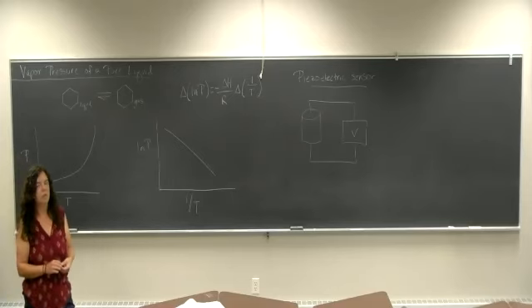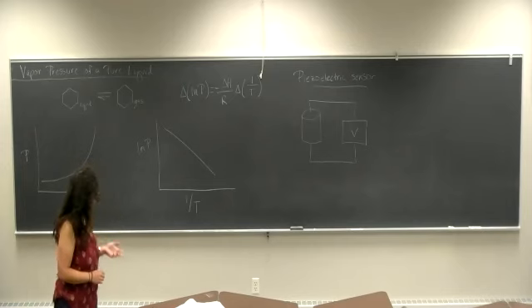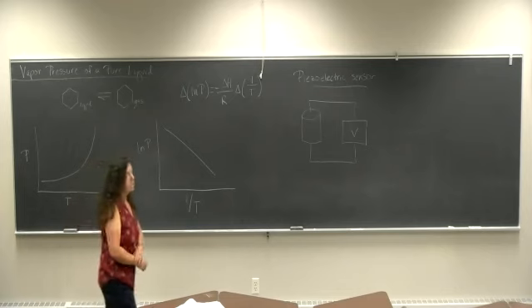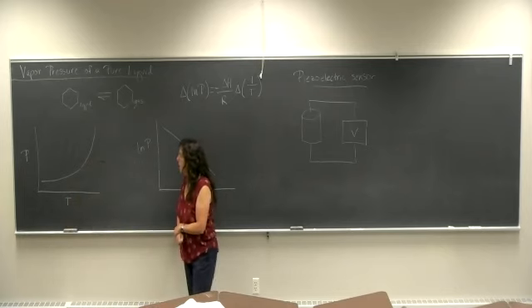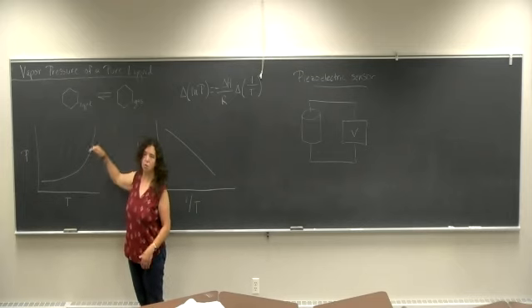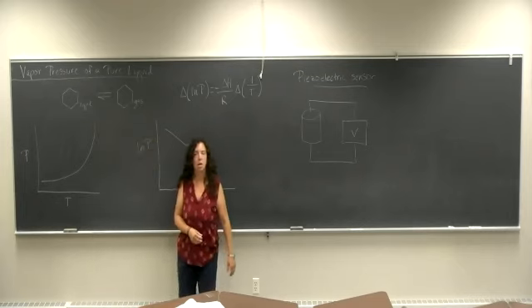In this video, we'll be talking about Project 4, the vapor pressure of a pure liquid. In this experiment, we'll see the temperature dependence of the vapor pressure of a pure liquid, in this case, cyclohexane.